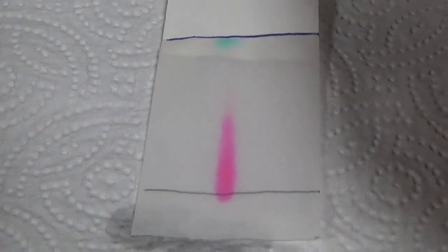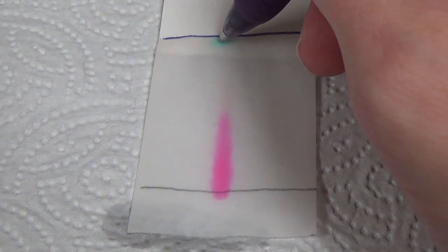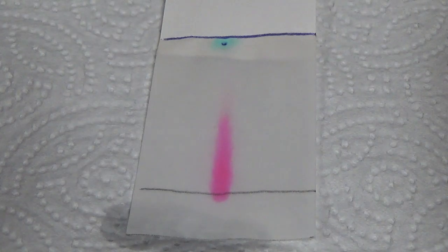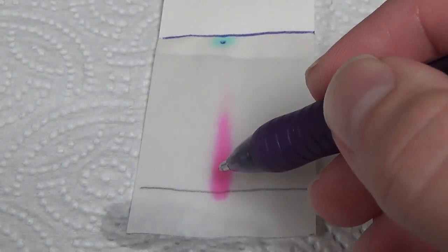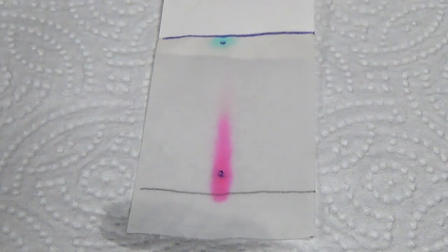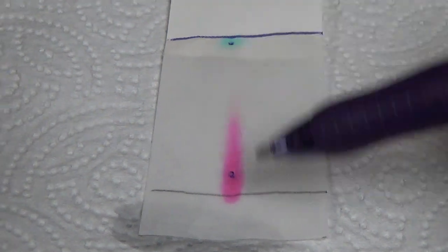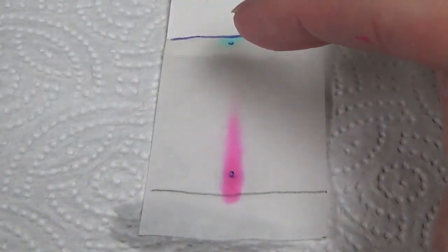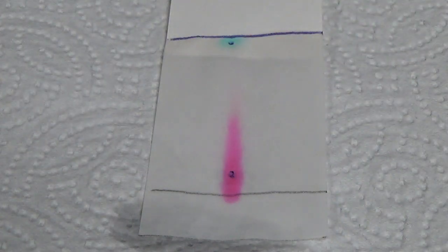And then I also want to find the center of the color blobs. So there's the center of my blue blob, and finding the center of my red blob, I feel it's kind of like right there. Okay, now if we waited longer, more and more of this red is going to be moving up and up and up, and so it would continue to separate them the longer we give them. But this is certainly plenty for our qualitative work right here.